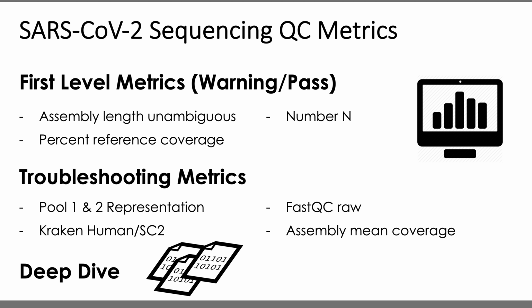Alright, so that's everything I have in this introduction to QC outputs. In part 2 of understanding Titan genomic characterization workflow outputs, I'll be covering the Nextclade and Nextstrain outputs generated. But that's all I have for now.